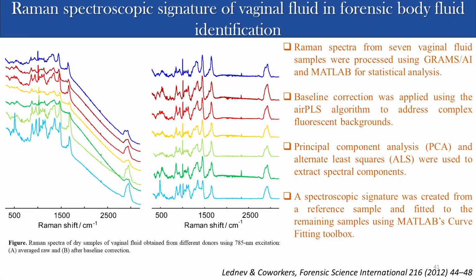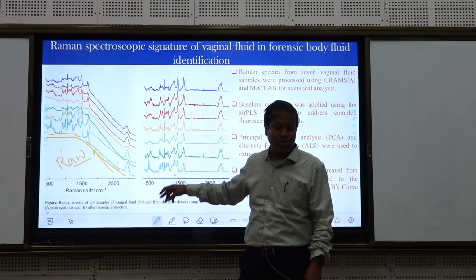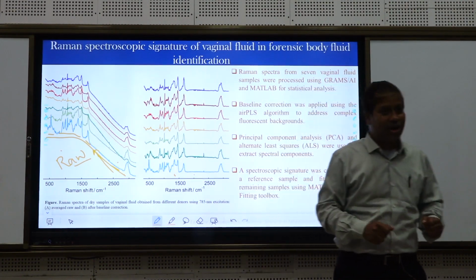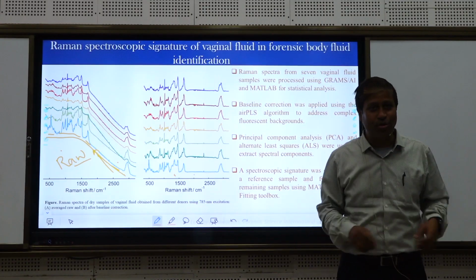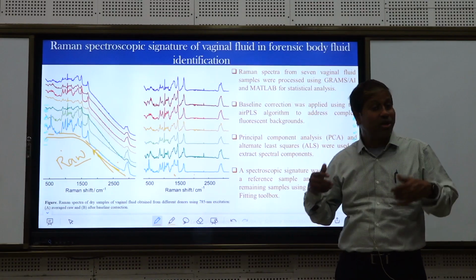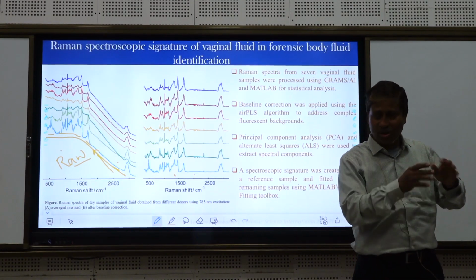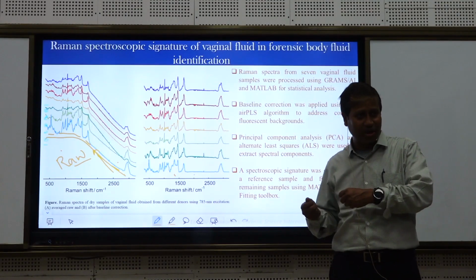This is called an algorithm. They write a program, and if you run that program on this spectrum, then you get a clear, acceptable spectrum. So there are some groups who are doing this. Now imagine if those kinds of groups did not do it, then you would not get a good spectrum. But we never think of contributing in that line. One should think of contributing in fundamental work even if it is not prominent.